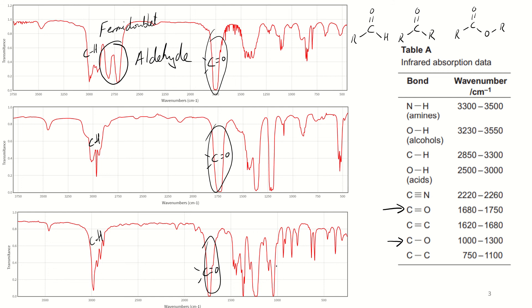But we'll have a guess and say that we've got this peak down here, whereas the other looks fairly smooth. Possibly it could have been that. You could have made an argument for it either way. So we're just going to say, having a guess, this one is the ester, and this one is therefore the ketone.